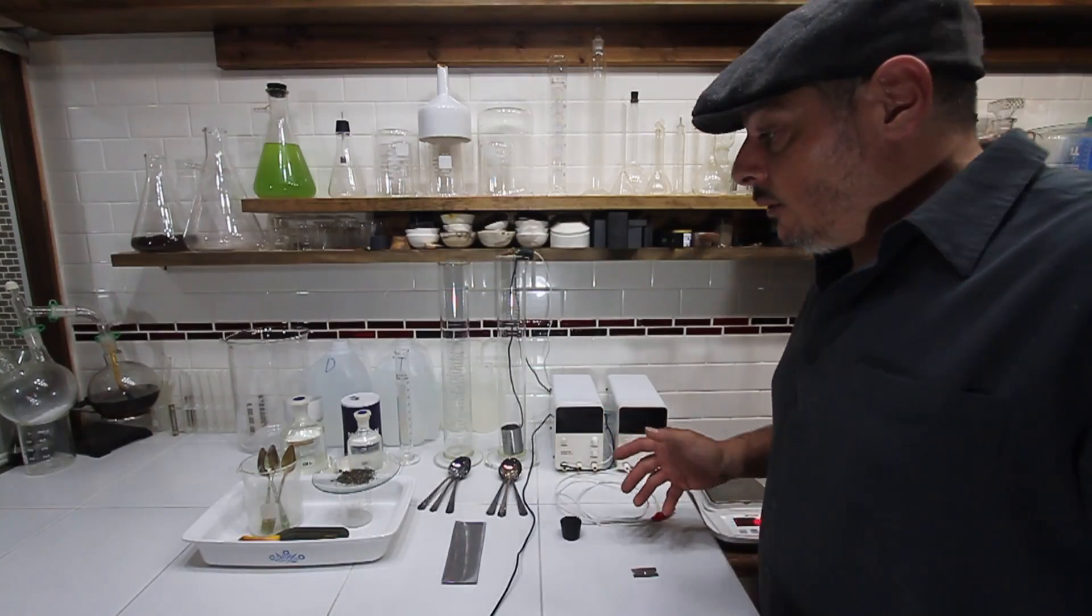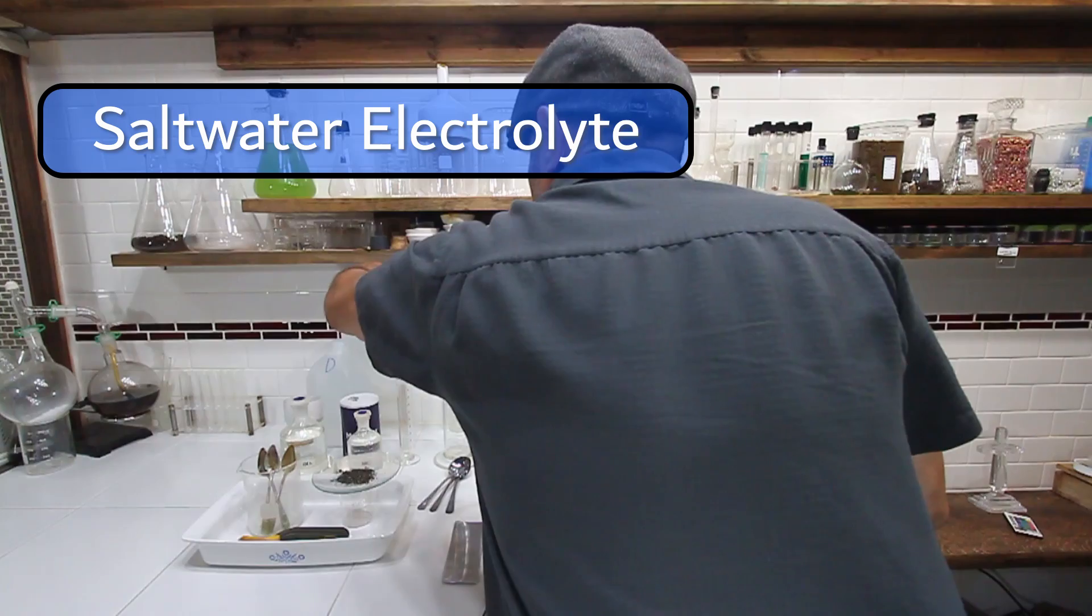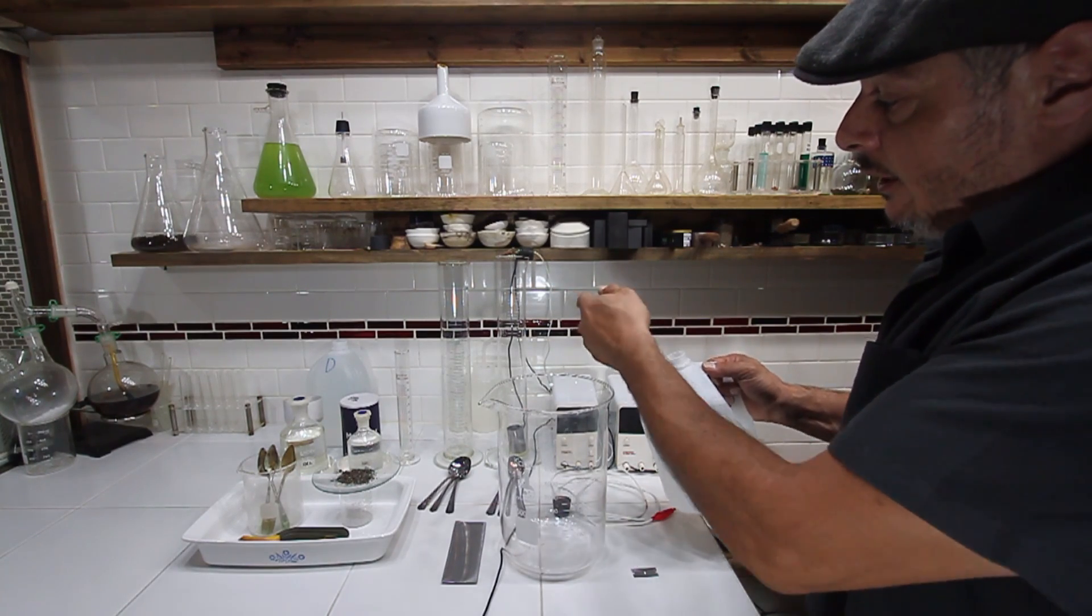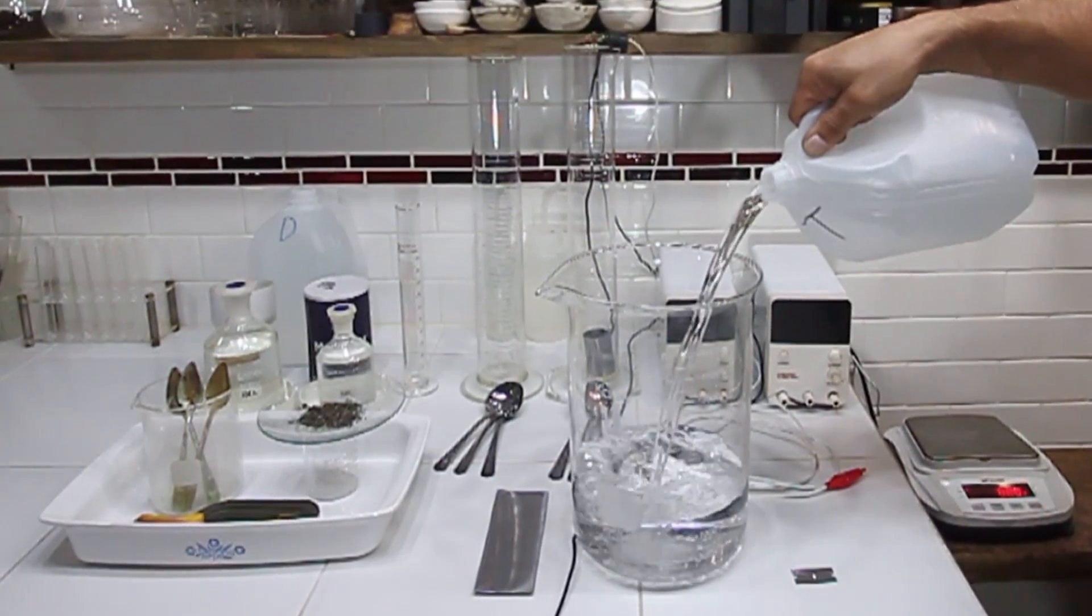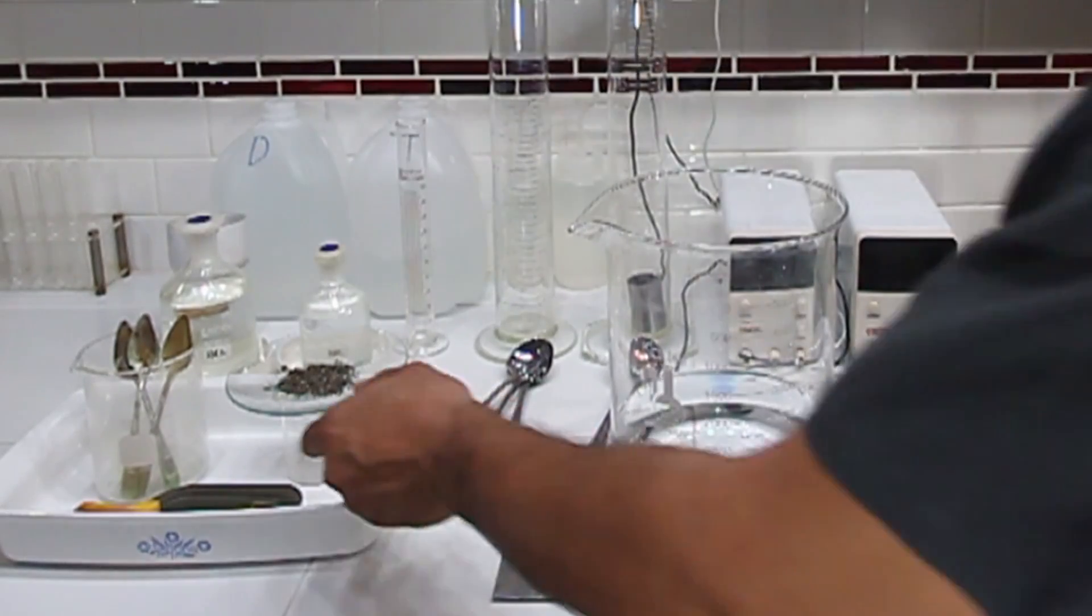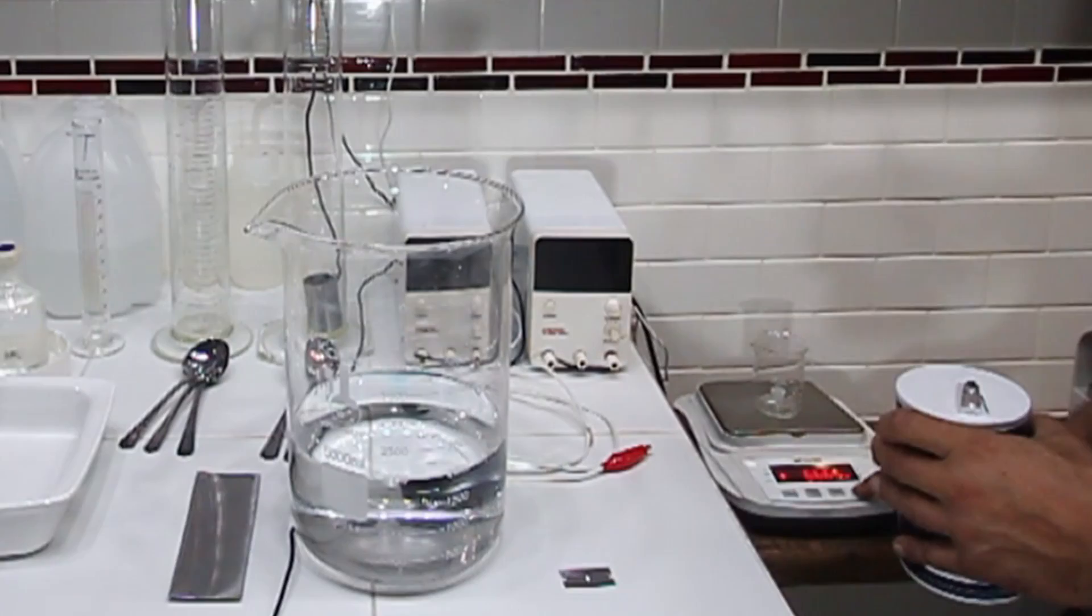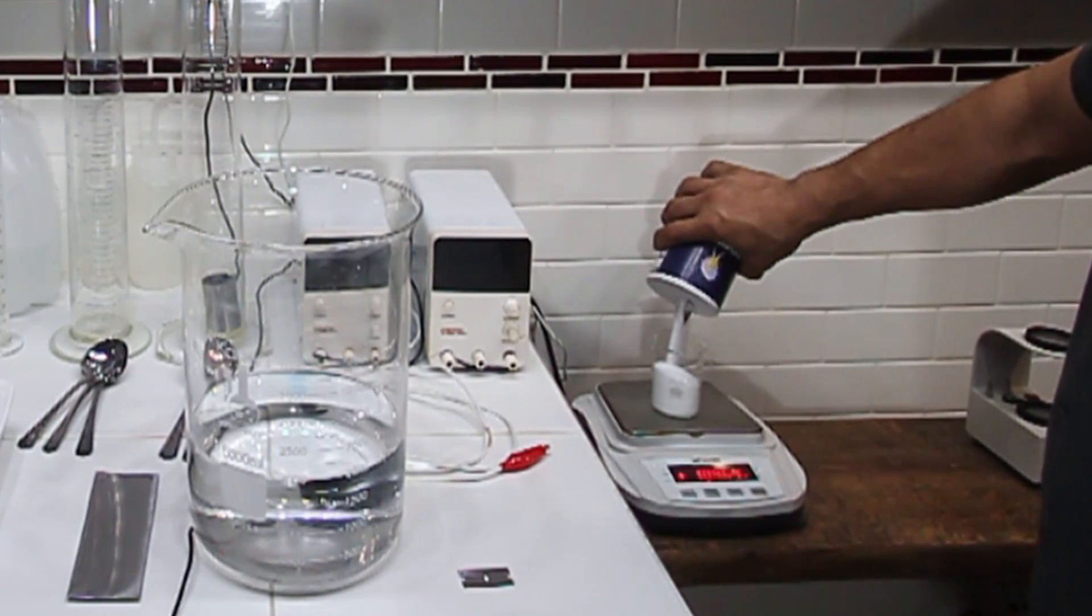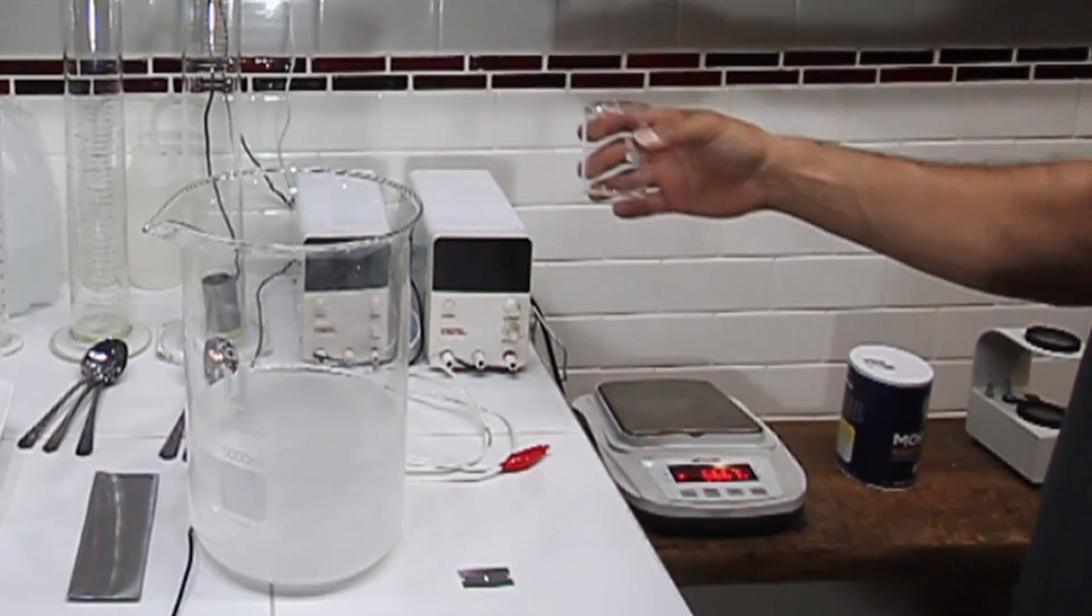First thing we need to do is make a saltwater bath. I'm just using tap water for this, so I'm going to do about 800 milliliters in each beaker. I'm actually going to do two liters here. Then we're going to measure out 200 grams of salt—100 grams of salt per liter. So 200 grams of table salt and two liters of water.